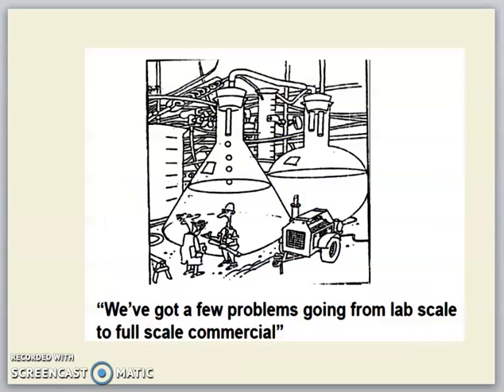The knowledge of scaling up is really important as a chemical engineer or a biochemical engineer, because the product that we produce will be commercialized. It will be sold to the community. So we need to know how to increase the production volume from the small scale or lab scale into a full commercial scale.